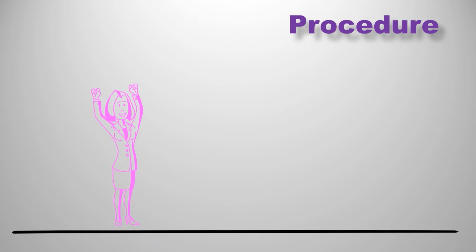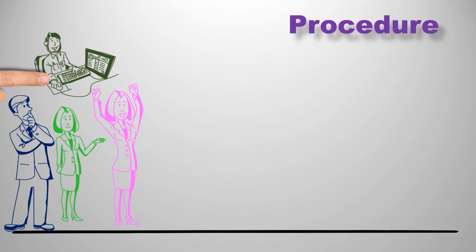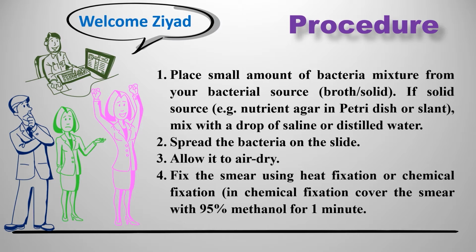Hi guys, our lesson today is going to be preparation of a smear. We would like to prepare our bacterial sample for testing under the microscope. We would like to visualize this bacteria. The first step is to prepare the smear for microscopic testing.